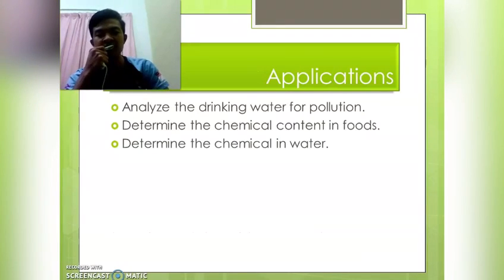And this application is used to analyze drinking water for pollution, determine the chemical content in food, and determine the chemicals in water. It's not just about seawater, but also rivers and ponds, the water sources.